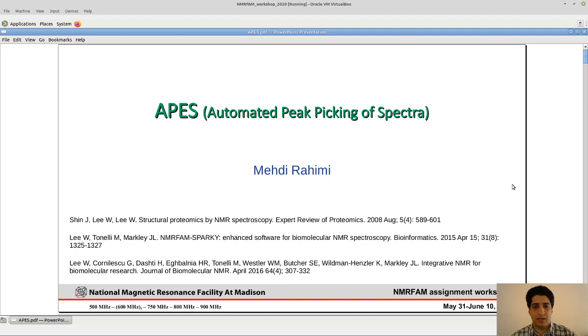I'm Mehdi and in this section we are going to go over the automated peak picking of Spectra, or in short APES.